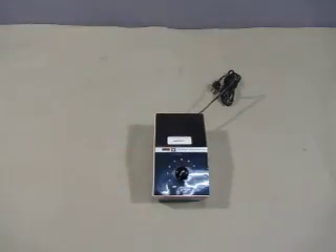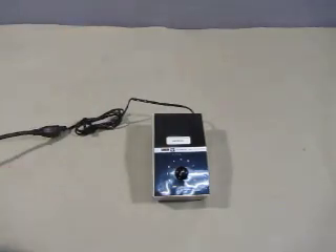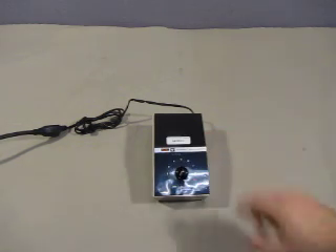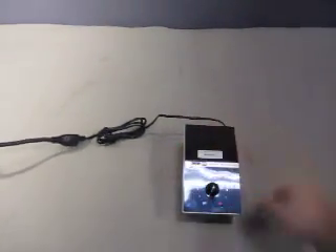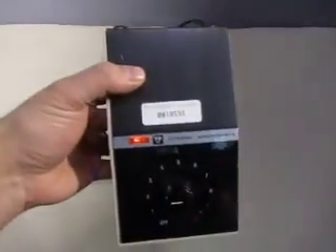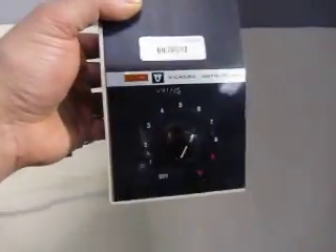It says Vickers Instruments, made in England. And a little bit of chipping here, but it's not in bad shape. Let's see if it at least turns on — I don't have a light source so I can't fully test it, but let's just watch the light. The light comes on, and you can see the light actually come on. And it shuts off. So I'd say it works, or it should work — no guarantees.